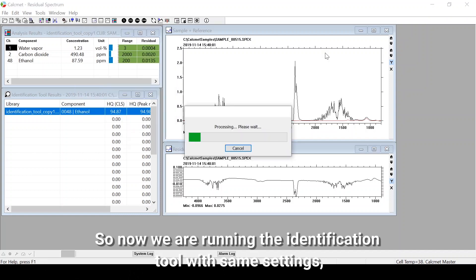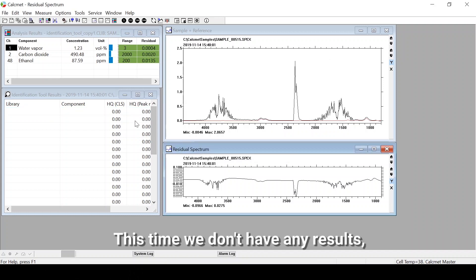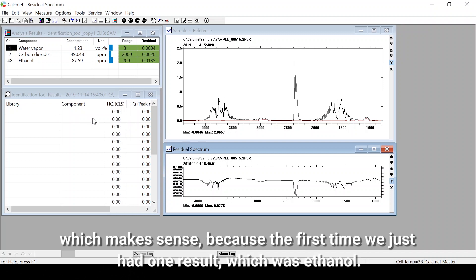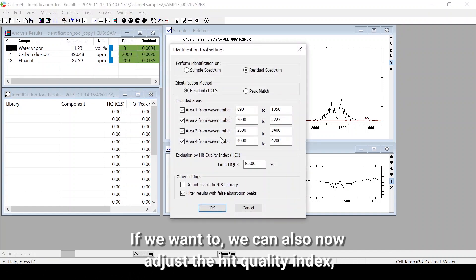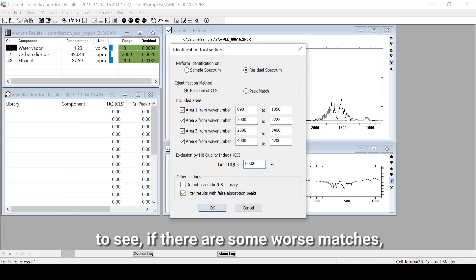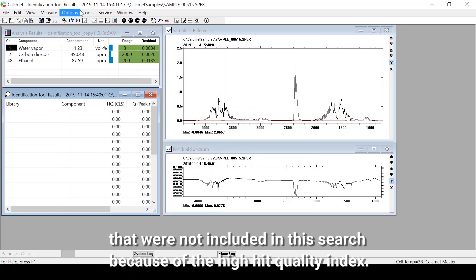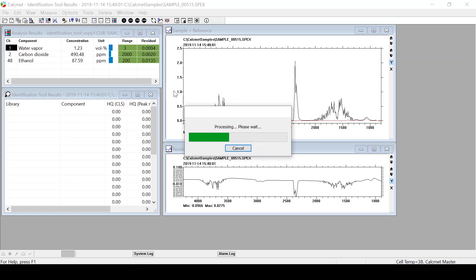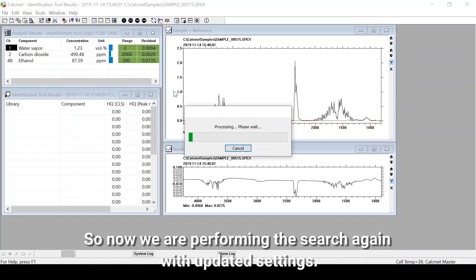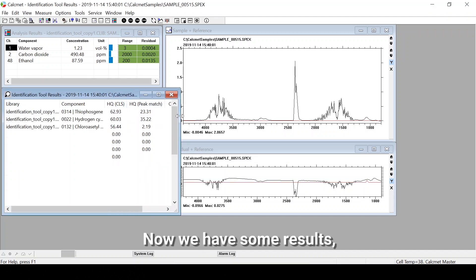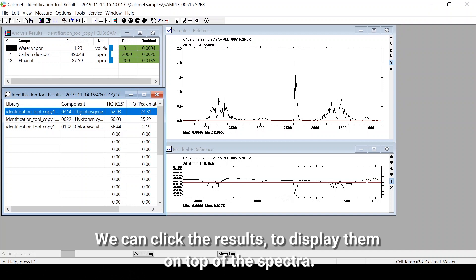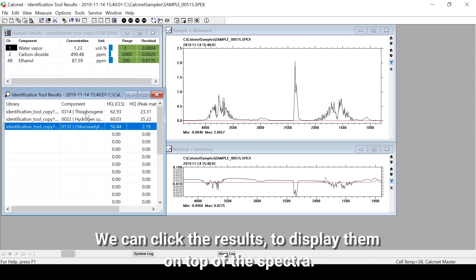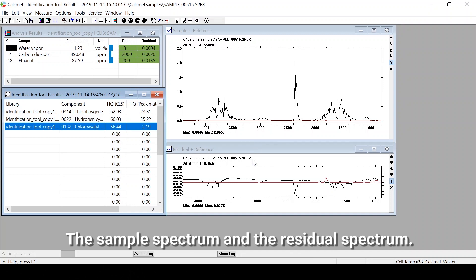Just to be sure, we can run the identification tool again to check for any other components. We are running it with the same settings as before. This time we have no results, which makes sense since the first run only identified ethanol. If we want, we can adjust the hit quality index to see if there are some worse matches that were excluded due to the hit quality index threshold. We run the search again with updated settings and now have some results, but the hit quality indexes are not very high. We can click the results to display them on top of the spectra.